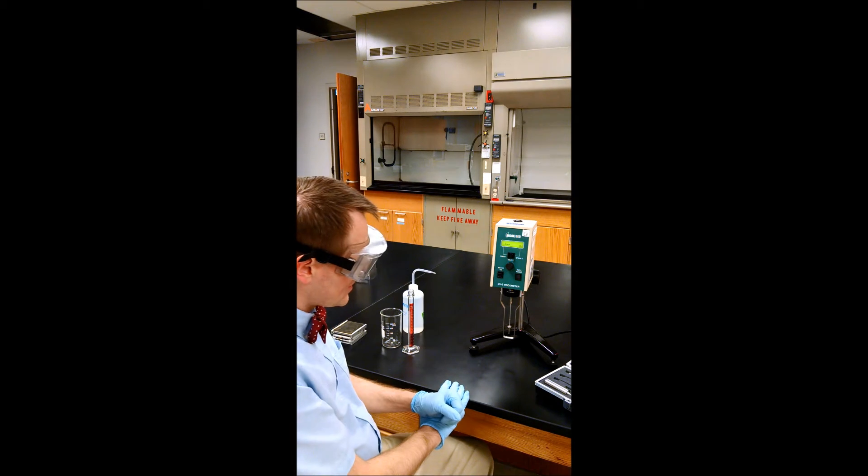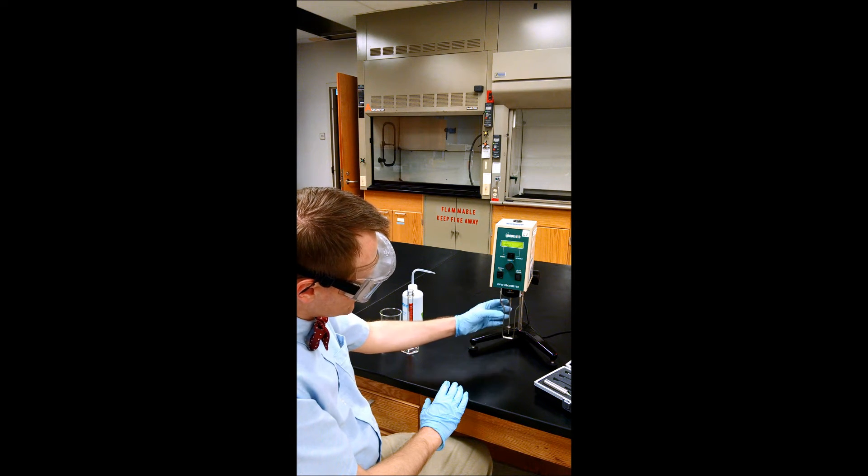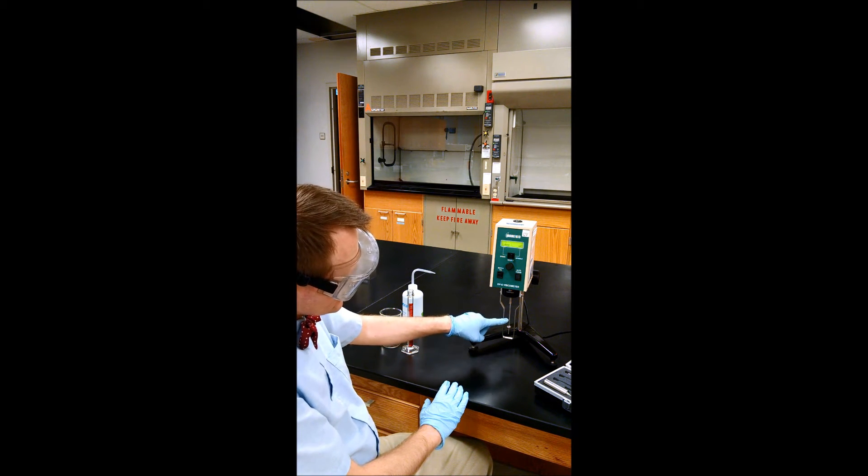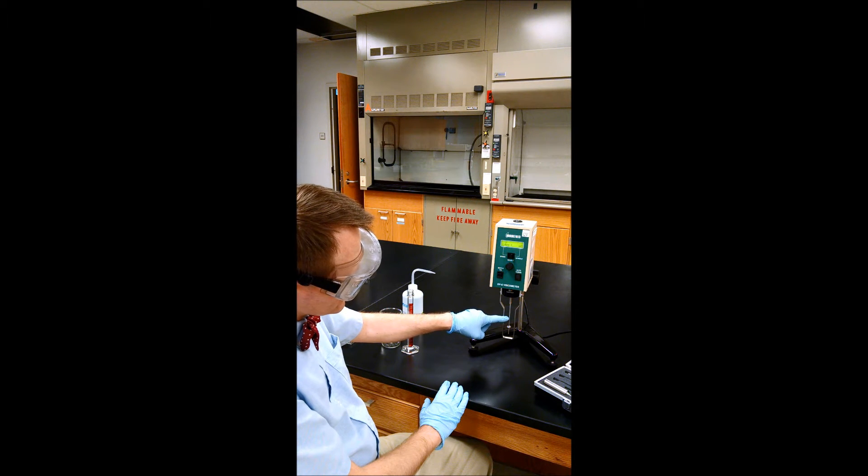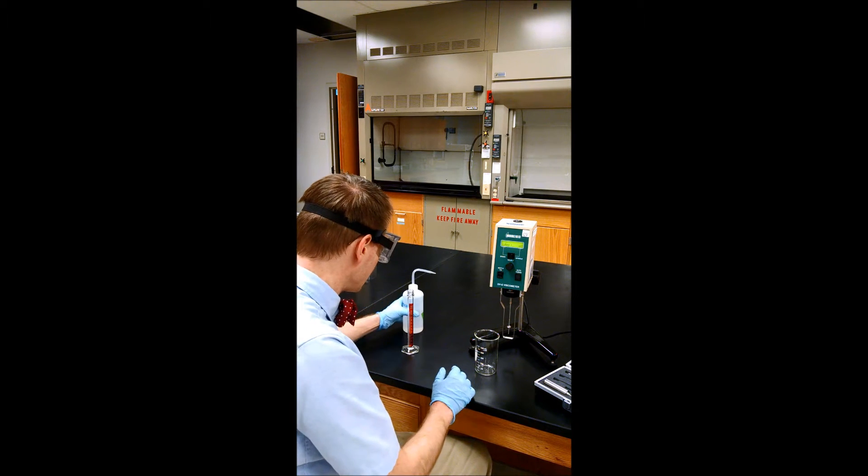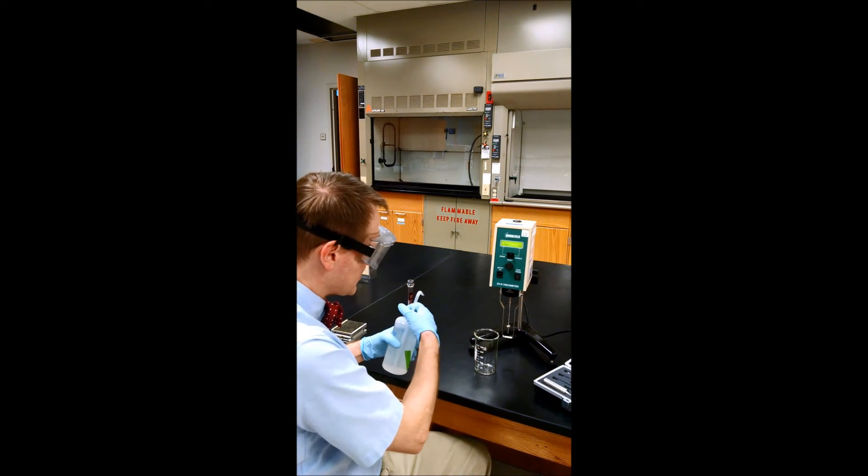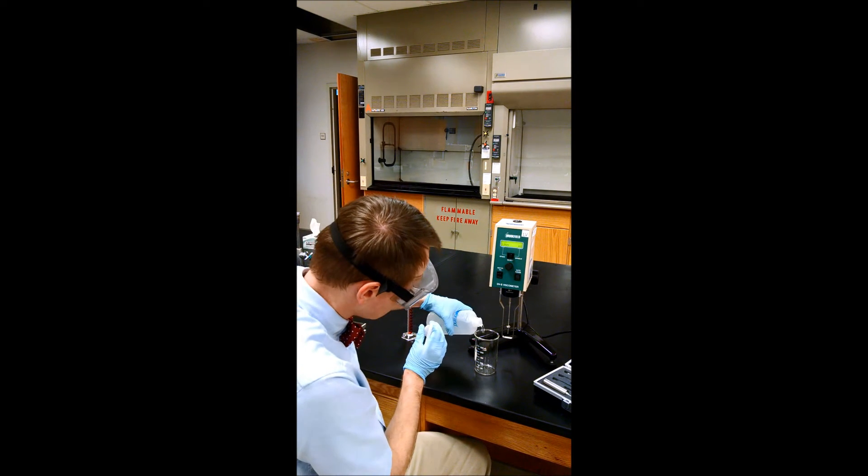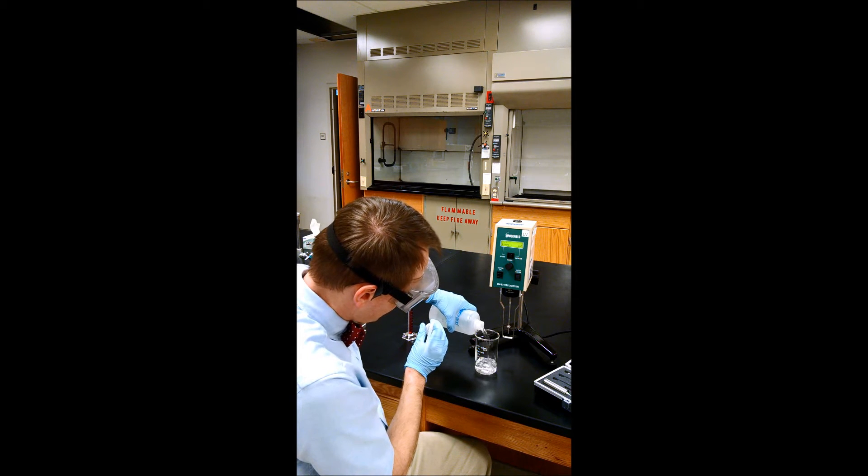Now our spindle is in position and we're going to immerse this into our liquid so that the liquid is up to this level of the groove. We're going to use a tall form beaker and add enough liquid.